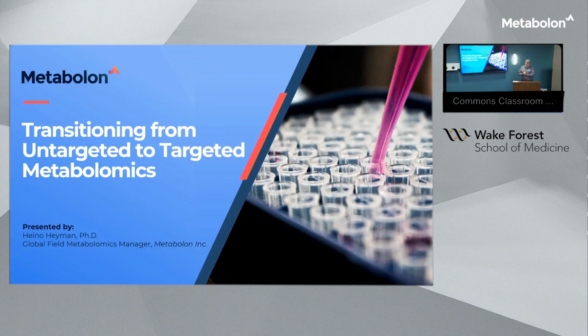So what you have heard from Nicole and Annie is really why metabolomics, and really understanding the intricate aspects of using the data to find those very nice patterns within the biology, right? And so what I'll show today is just how we do untargeted metabolomics at Metabolon.